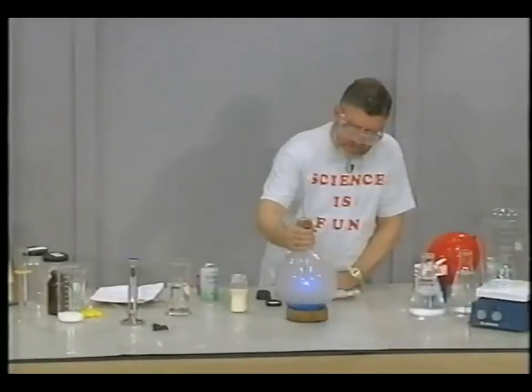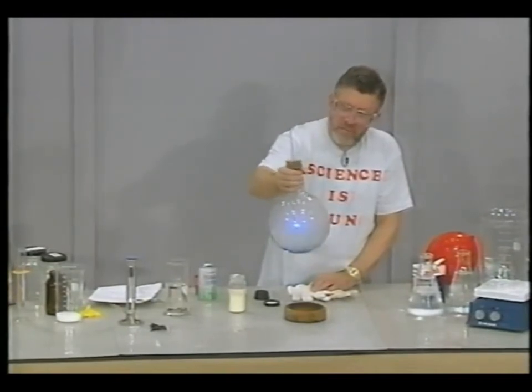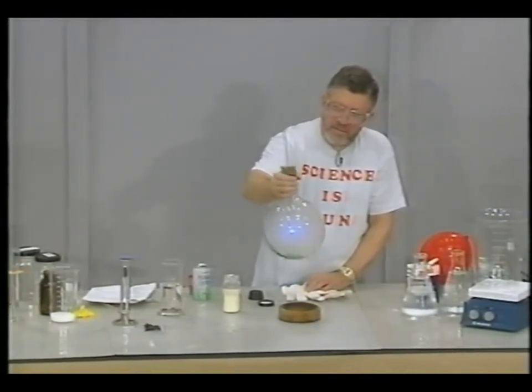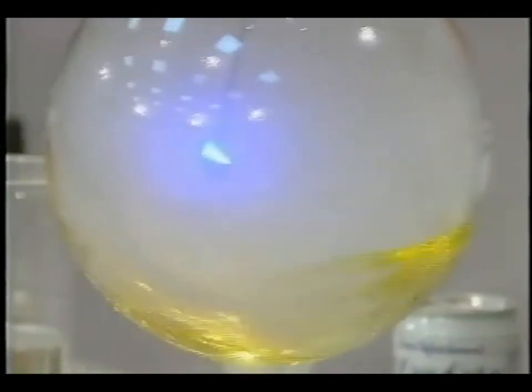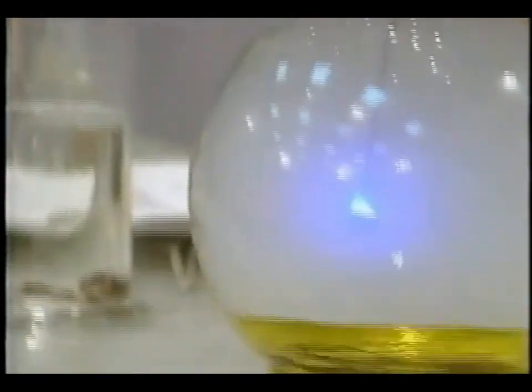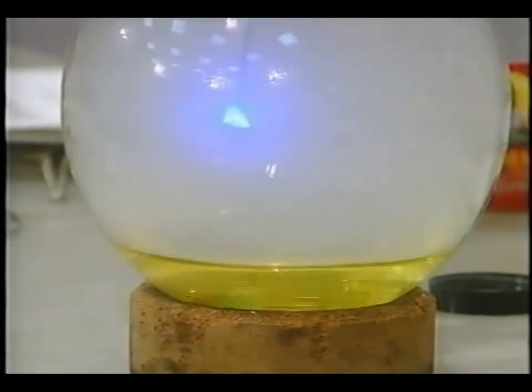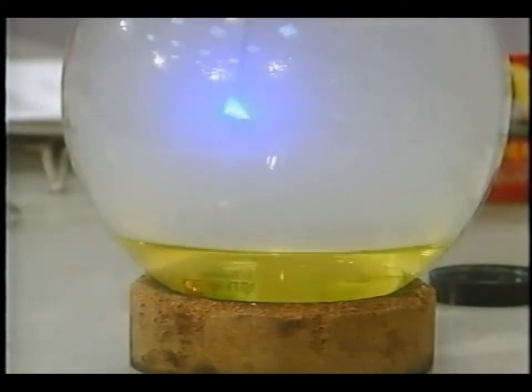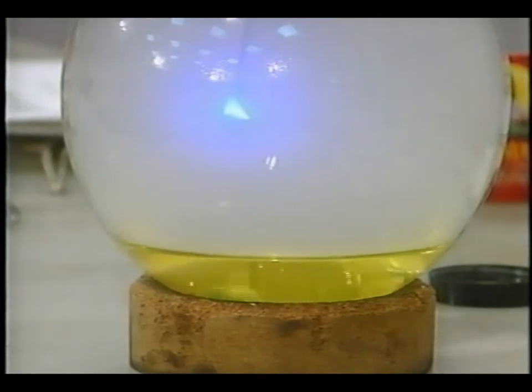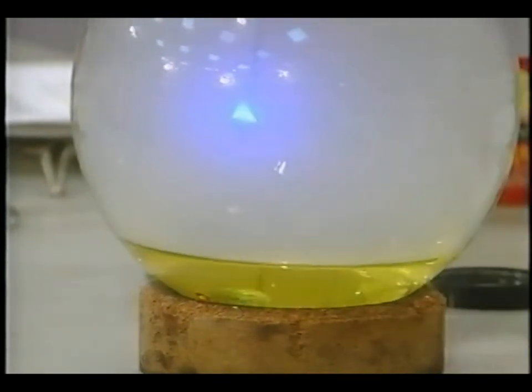What I'm going to do is lift this up and mix the sulfur dioxide with the indicator solution that's in there. And you see what's happened. Again, the color change indicates to us that a chemical reaction has taken place. In fact, this is the kind of reaction that takes place when we form acid rain. The sulfur dioxide combines with the moisture that's in the air to form acid rain.